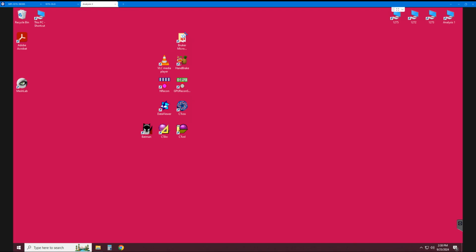Today we're going to be talking about how to make a one-time backup of your CodeMeter license information. So to begin, you need to be on the host computer for your CodeMeter license, which is connected to NRecon 2.0. If you're still using NRecon 1, this video is not for you, but if you have moved on to NRecon 2, then this is applicable to you.